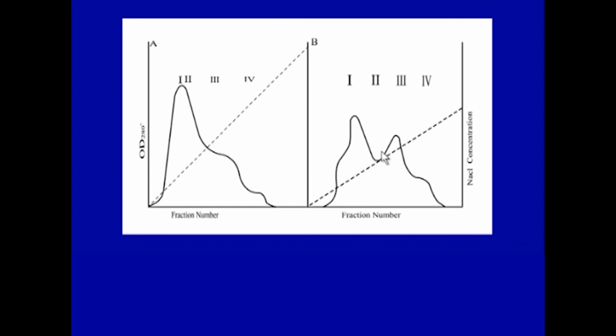That is very important. Separation of 4 peaks by ion exchange chromatography is shown here. In a higher steep gradient, only one peak is very clear, other peaks are not so clear, but in a shallower gradient, peaks 2 and 3 also become clear, and the existence of a fourth peak becomes obvious. So, as you go along doing these things, general guidelines are very clear, but one has to standardize one's own conditions to get the best results.